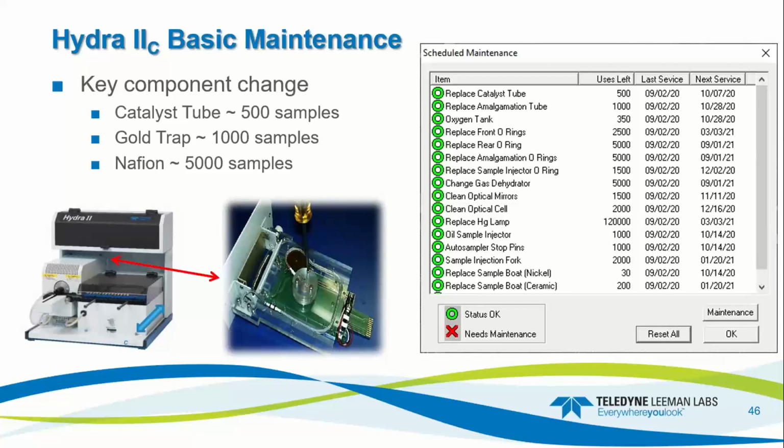So if you exceed your timer, and if your results are still good, then I certainly wouldn't take anything apart and fix it. But you have to keep in mind that it potentially could start to degrade in the middle of the run. So if you're uncertain and you want 100% assurance it's going to be okay, then go ahead and change or replace that component.